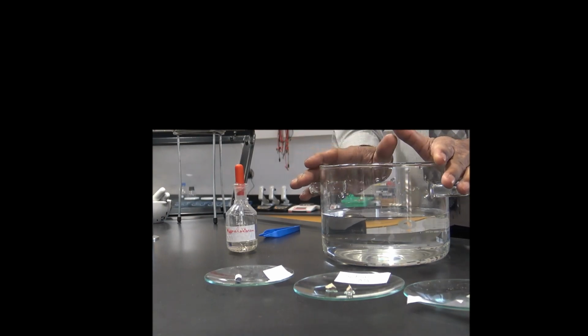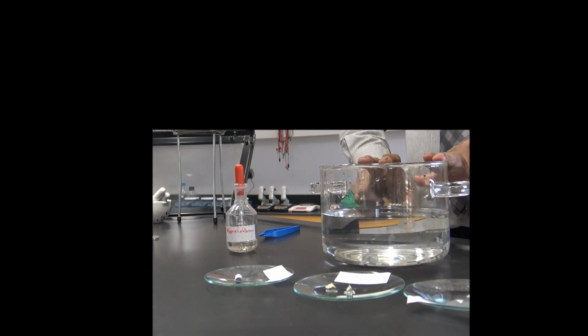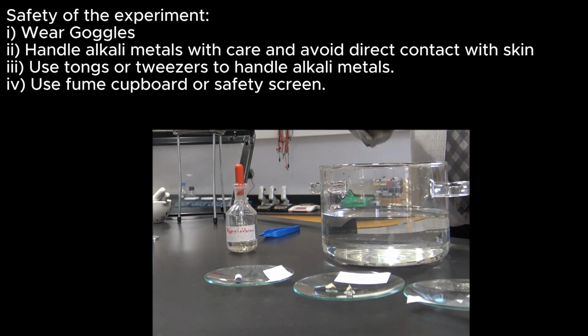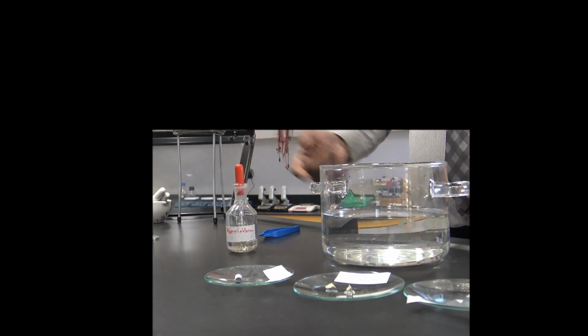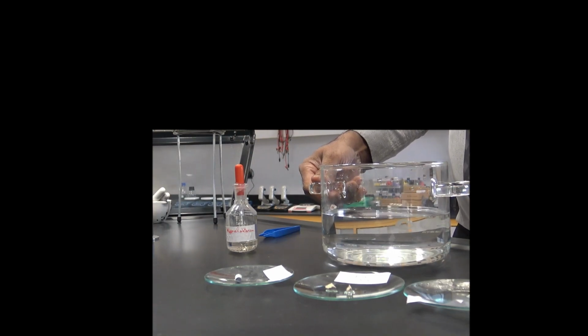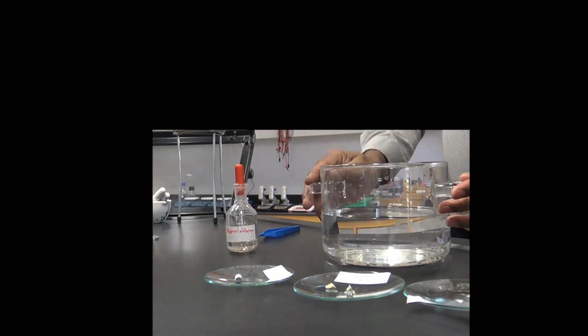Before we start anything, you need to understand that this has been done in the fume cupboard. That's safety first. You should have your goggles on during the experiment, and if gas is coming after the reaction, we can turn on the gas exhaust, which is totally safe. What else can we do in this reaction? When we go for potassium, sometimes we use a shield to protect students from the reaction.